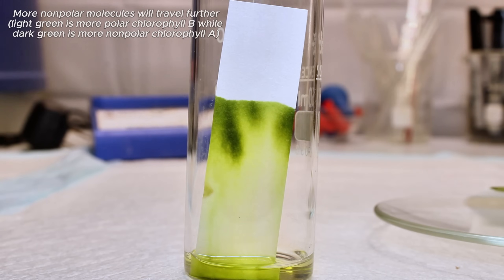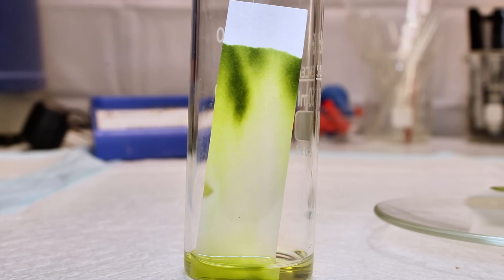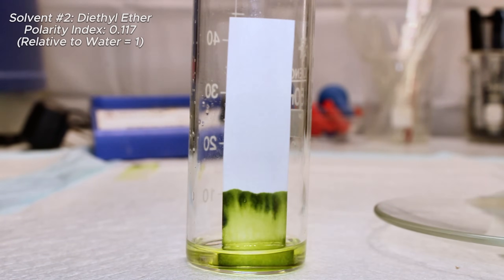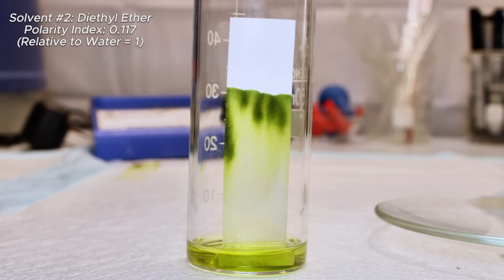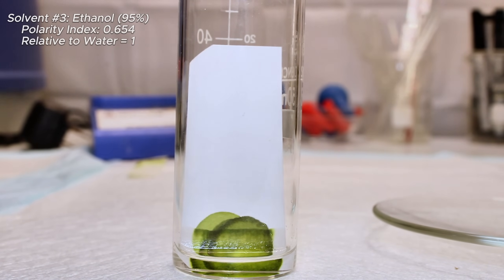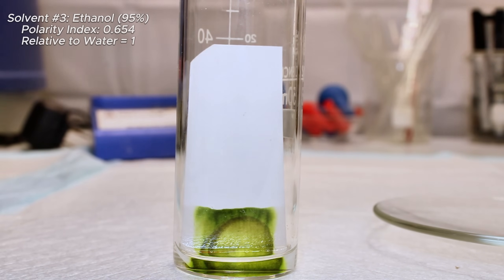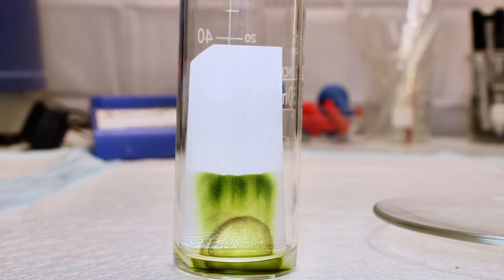In paper chromatography, how well a compound keeps up with the solvent front indicates how well that solvent dissolves it, because this type of chromatography takes advantage of the difference in the sample's affinity for the mobile phase versus its affinity for the stationary phase. The first solvent was ethyl acetate, which did an excellent job of pulling the chlorophyll through the paper, making it an excellent solvent for chlorophyll. The second solvent I tried was diethyl ether, and by the looks of it did similarly as well as ethyl acetate. Both ethyl acetate and diethyl ether are non-polar solvents, with ether being considerably more non-polar. Third, I tried ethanol, which was considerably slower given the much lower vapor pressure of ethanol relative to something like diethyl ether. Ethanol is a fairly polar solvent, being more polar than isopropyl but less polar than methanol. The ethanol was actually doing a fine job pulling the chlorophyll through, but something dark orange and nearly red was being left behind. This made me realize I was forgetting a whole other class of compounds I had been extracting all along: carotenoids.